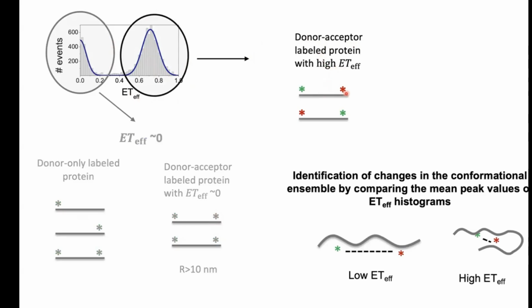And so even if you just do a qualitative measurement, it's important to look for changes, for example, of this mean FRET efficiency as the protein, for example, binds to another biological partner. Of course, if the FRET efficiency is high, it indicates it might have long-range contacts or a more compact conformation. For example, if upon binding it gets more expanded, the FRET efficiency should decrease.